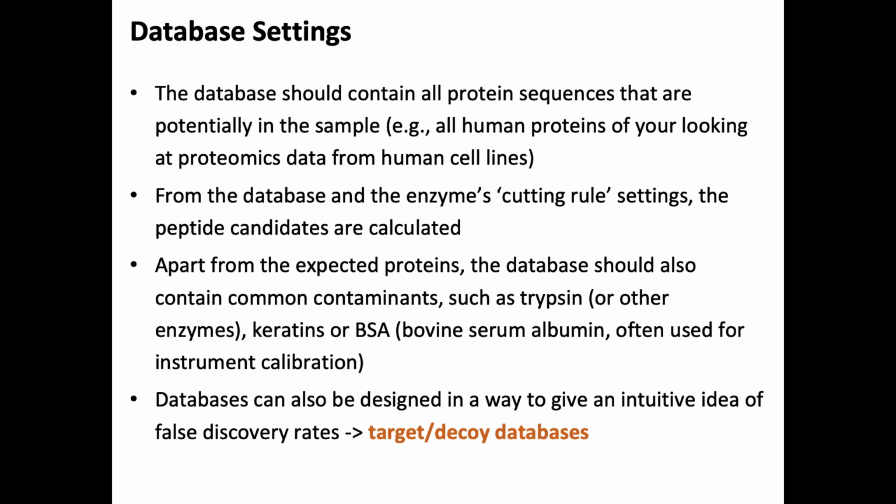What happens if you don't do that? Yeah, then you can get hits to other proteins, and it could seem like these proteins are in there, even though what you have is just trypsin, which is kind of boring. But, you know, it's there, so it should be included.